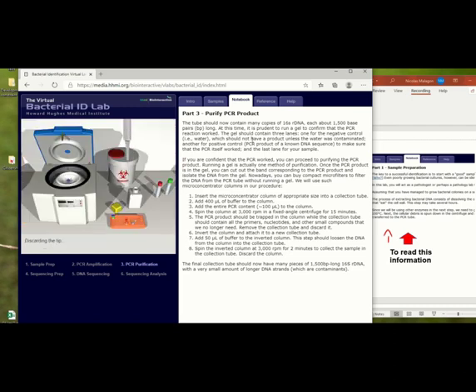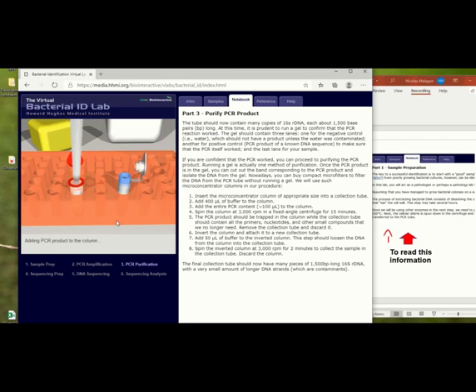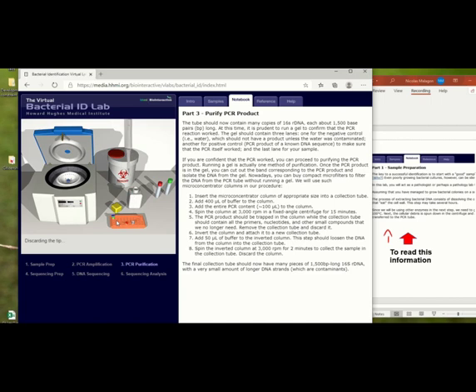Here they can tell you more about this, and a buffer solution, as we study in class, is a solution that allows you to maintain the pH constant. Now click here to continue, and you can continue pipetting. And then you have to put these samples in the centrifuge, and you have to counterbalance them.